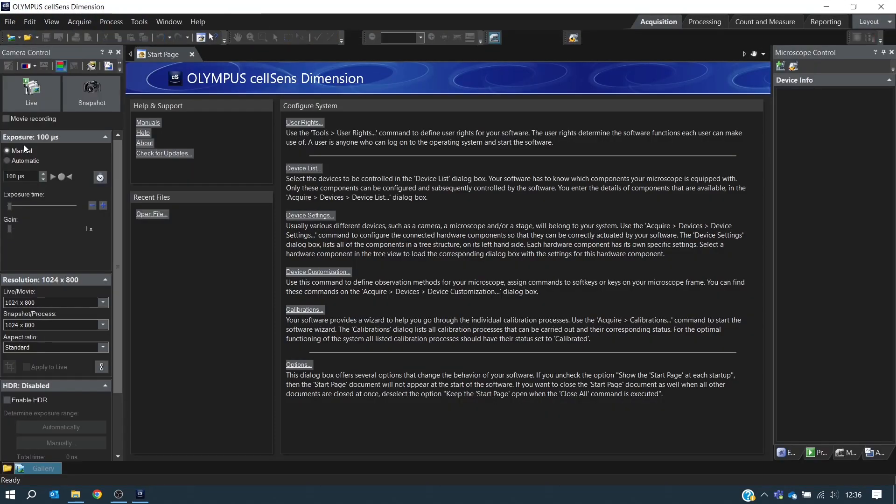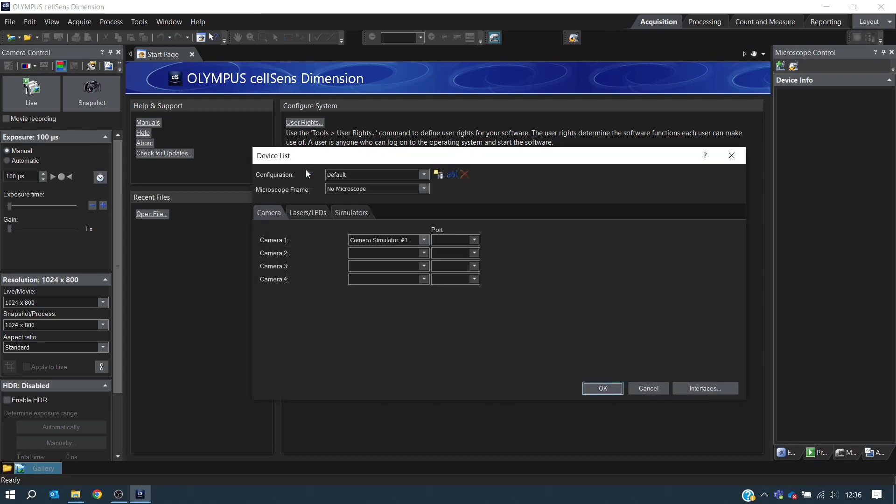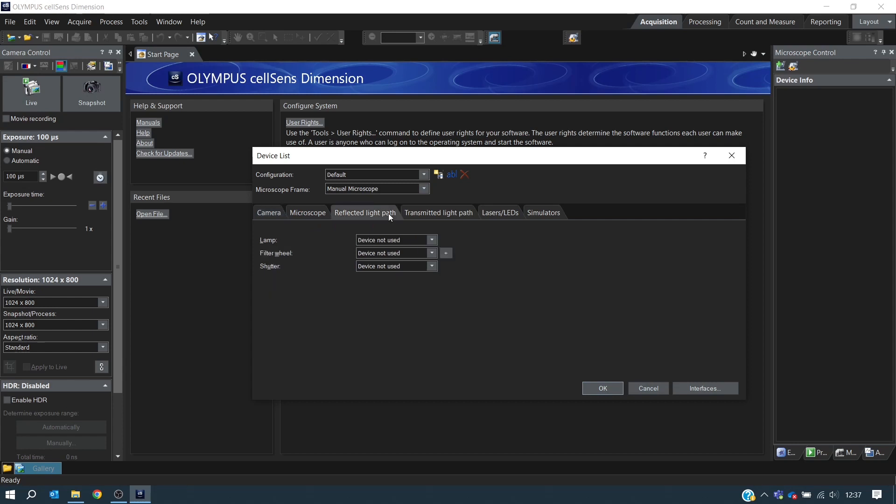To add the PE4000 to CellSense, navigate to Device List. In this case, we are using a manual microscope, and this now presents options for the reflected light path. Click this. And under Lamp, we select the Cool-LED PE4000.